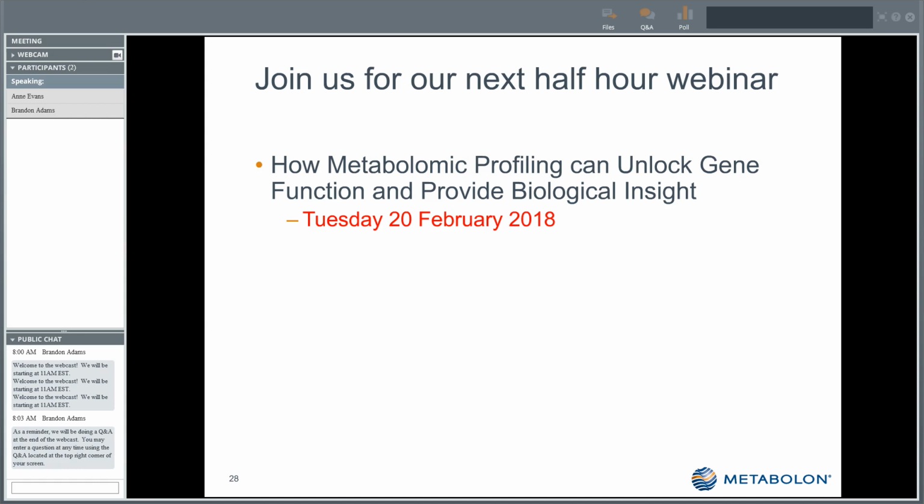The only other thing I wanted to mention about that is, within a project, you want to maintain that it's the same type of sample. So serum, if you're going to be running a serum study, make sure all of your samples are serum. Don't mix EDTA plasma and serum. That's going to certainly cause issues within the data.